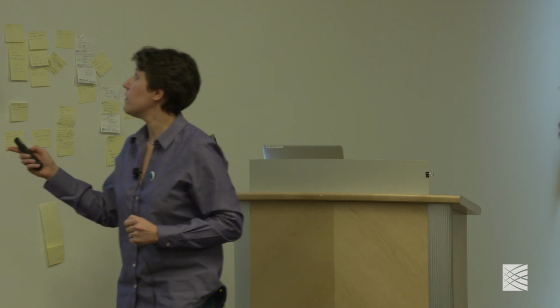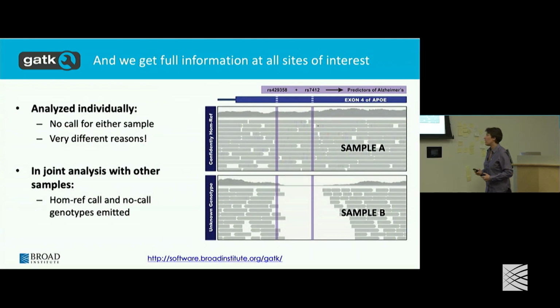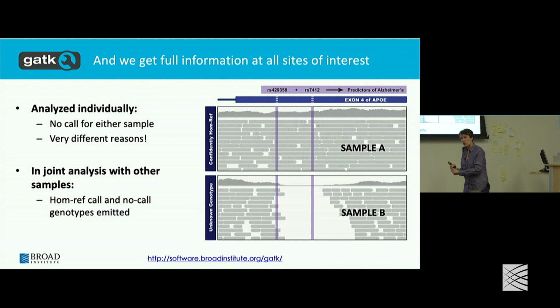Okay, all right. So finally, and this kind of goes to a question that was raised earlier, the key thing in terms of what we're producing in the VCF output with that reference confidence in the GVCF output is that we're going to have that super important information about if we're not getting a variant call, is it because there is good evidence that there is no variation, or is it because there's insufficient evidence either way? And that's going to be quite important for the interpretation.